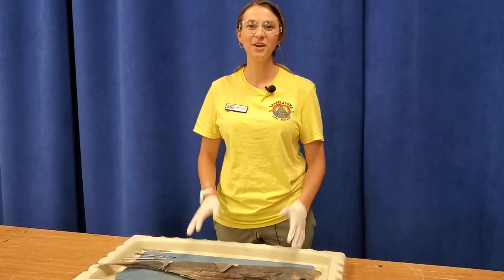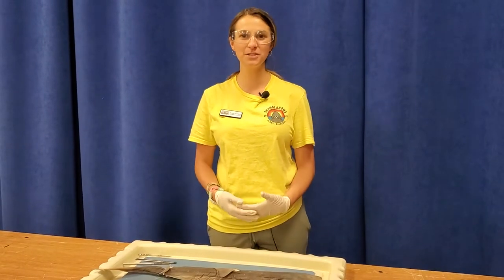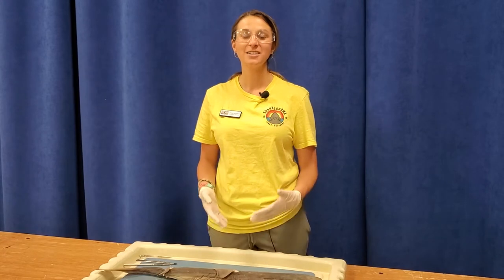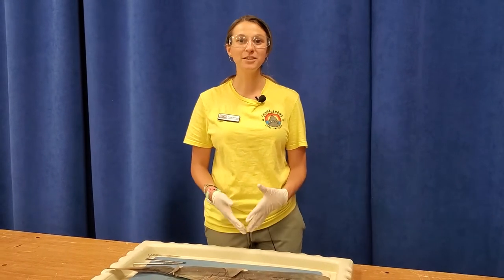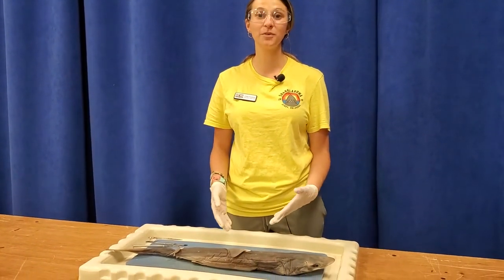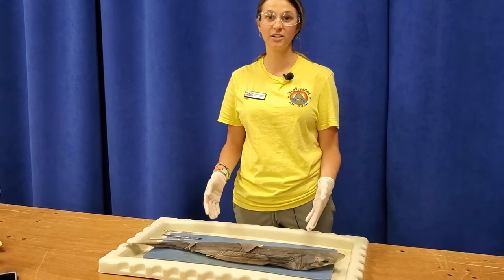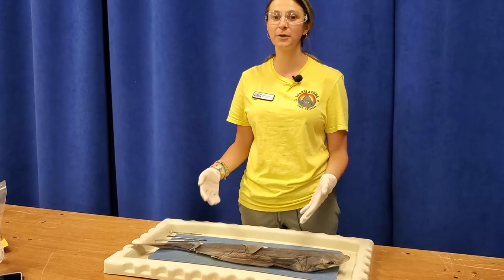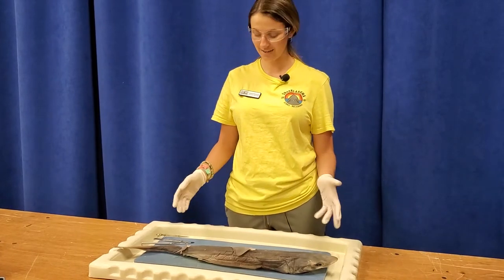Hey campers and welcome to the summer submarine. I'm so glad you're joining us. Today we're going to be doing something special for our shark adventure week — a virtual dissection of a dogfish shark. I'm going to start by describing some of the external features and then cut in and show you some important parts of a shark's anatomy. Even though this is a small dogfish shark, it has all the same body parts as a bull shark or great white.